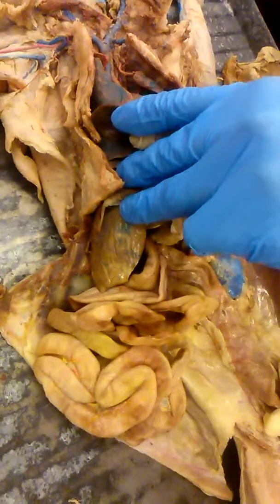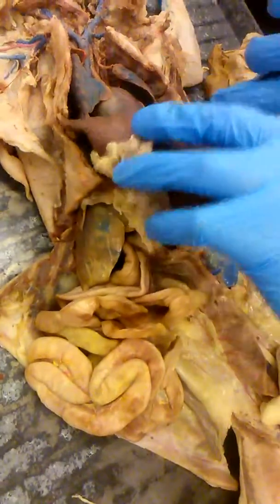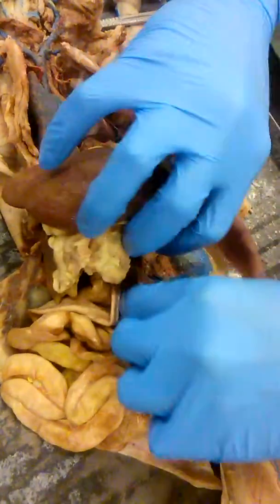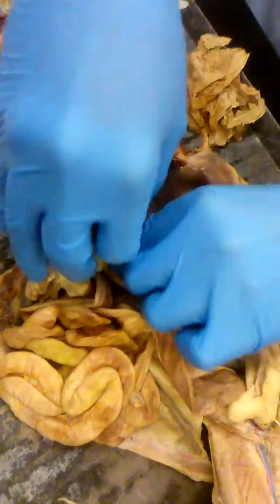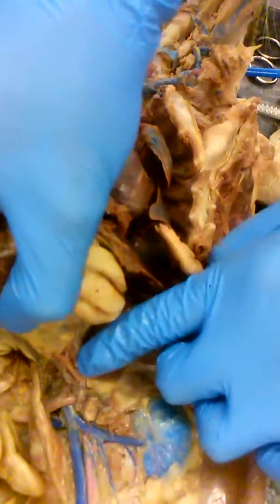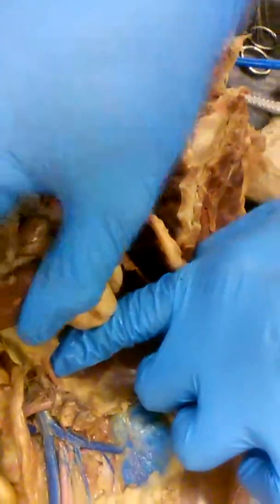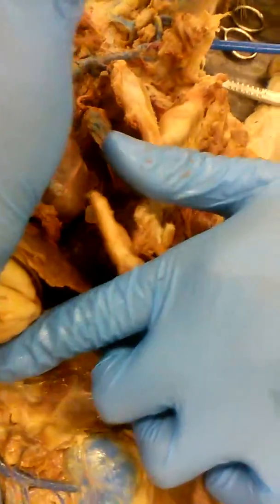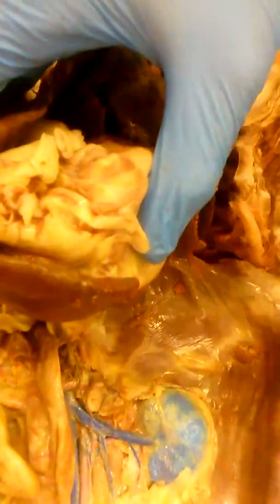So right here on the descending aorta, this is the celiac trunk. Just like in humans, it's that first branch. So thin. Yep. So up here you can see where it splits, but it's going to go to your spleen.